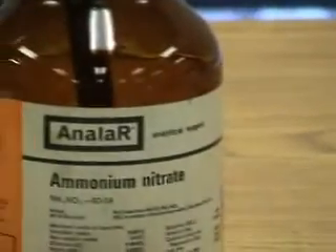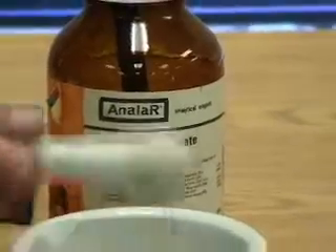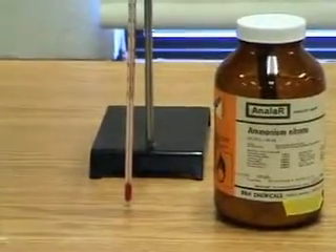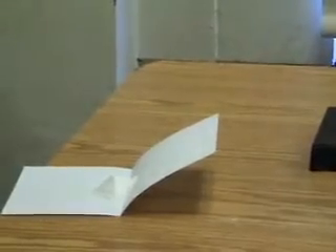You're looking at the samples of barium hydroxide and ammonium nitrate. We're going to put the ammonium nitrate into that barium hydroxide. Ground that up to increase the surface area.